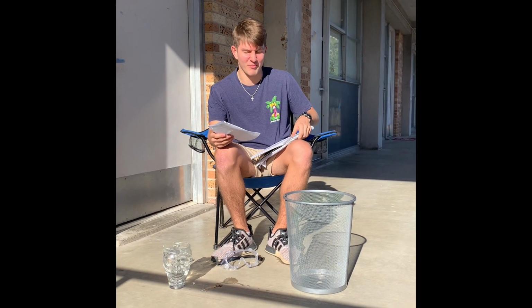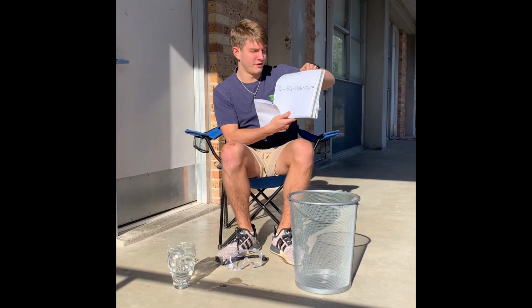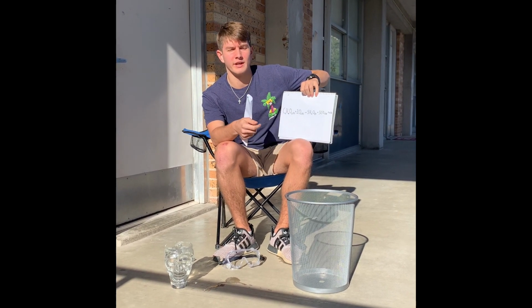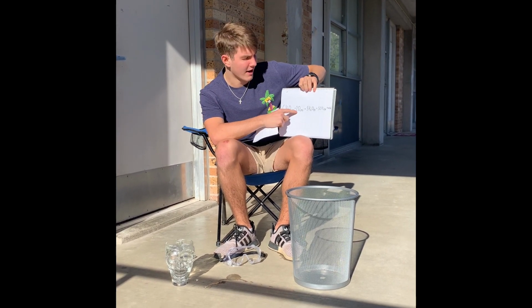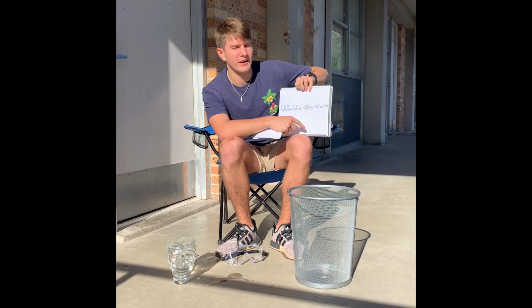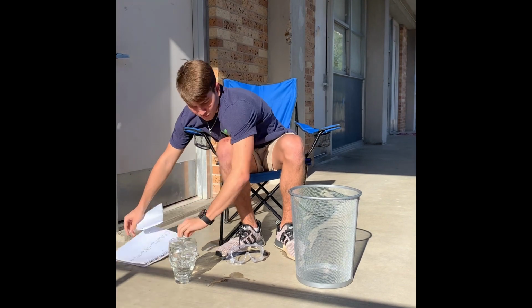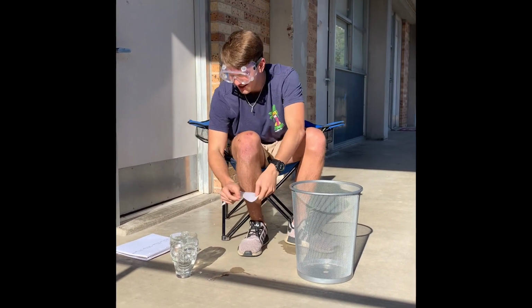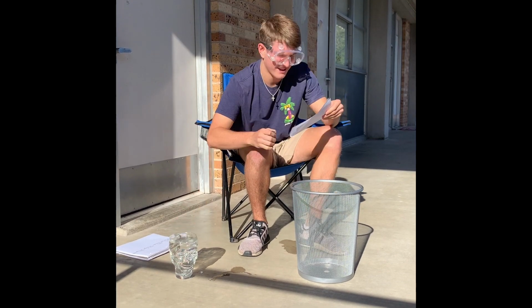We're outside now. I'm going to be demonstrating the chemical change where cellulose is going to interact with oxygen in the air, and I'm going to light it on fire. It's going to produce H2O gas and CO2 gas, as well as ash from the paper. So for safety reasons, we're outside. Got the goggles. Fire extinguisher to the left. All right, here we go.